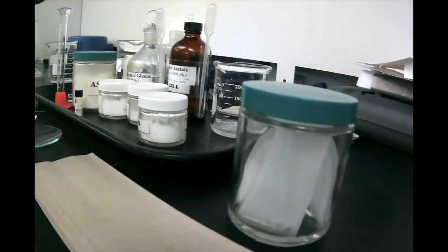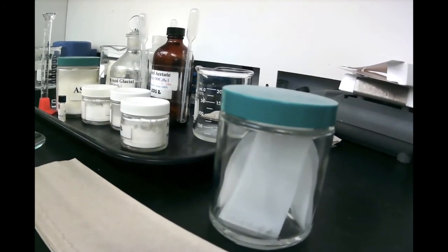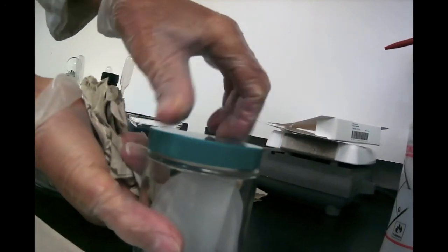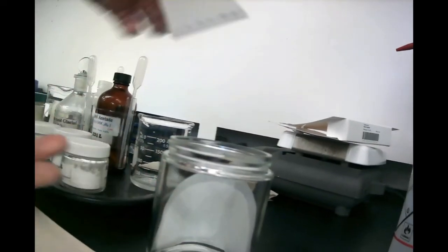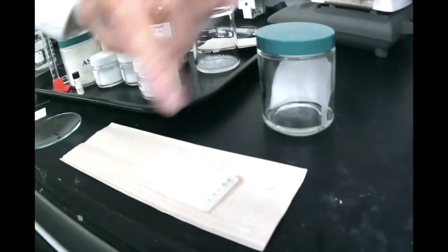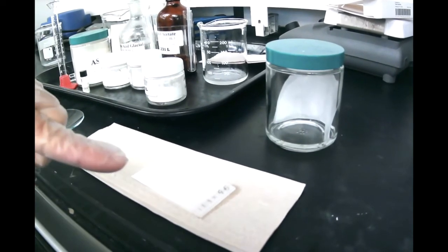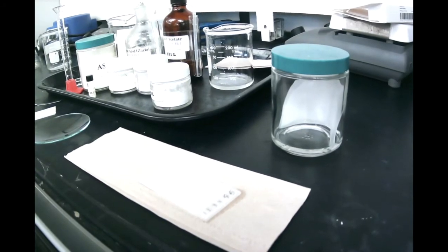So I don't know if you can see it very well, but I can see that the liquid is at that level of the pencil line. So at this point, you can open the jar and pull your plate and let it sit until it dries. So here's my plate, and you see that it dries from the top faster than the bottom because you have less liquid, and it looks almost like two different layers.